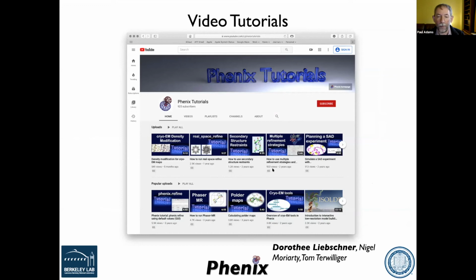So there's about 30 video tutorials. They tend to be around 5 minutes each. So it's a great place to look and get some introductory or, in some cases, some detailed information about some of the things in PHENIX. It covers a range of topics. And this is something that Dorothy has spent a lot of time setting up. And we'll be adding more and more of these tutorials moving forward.